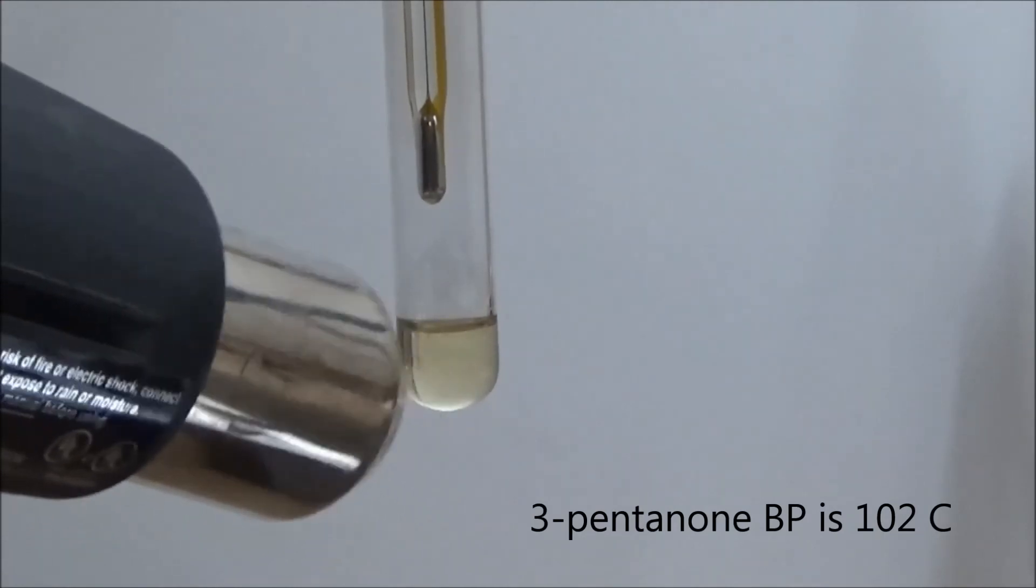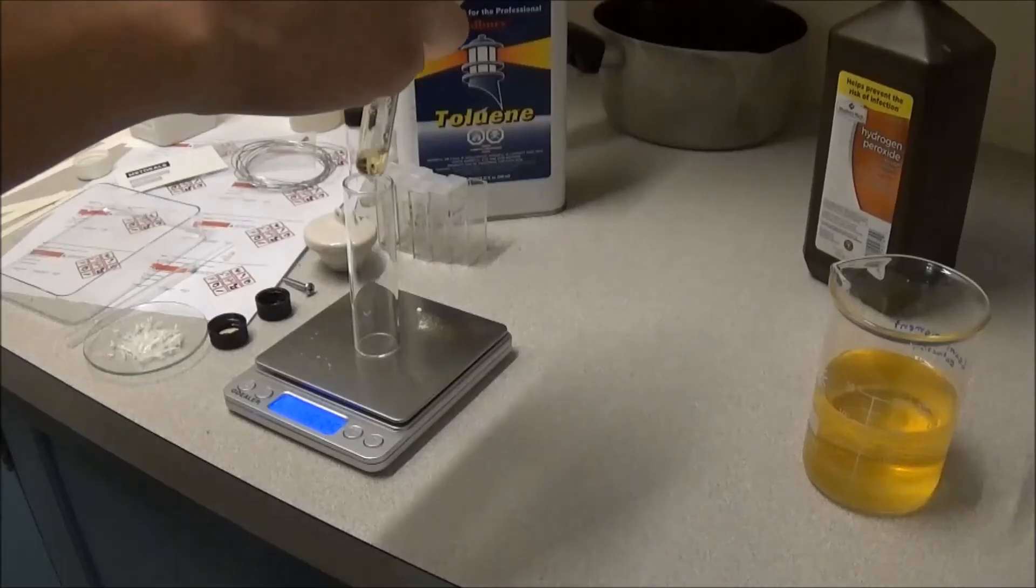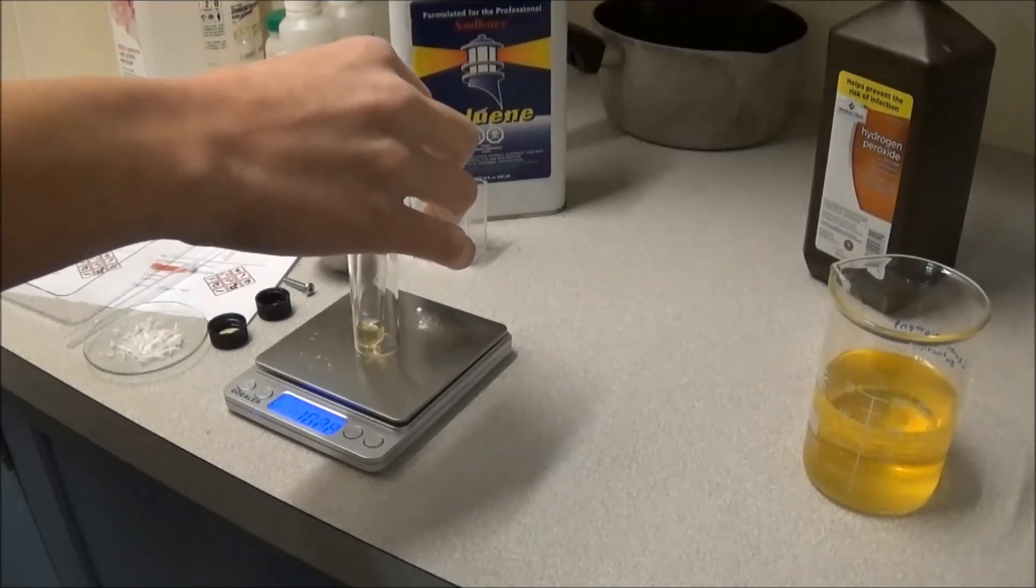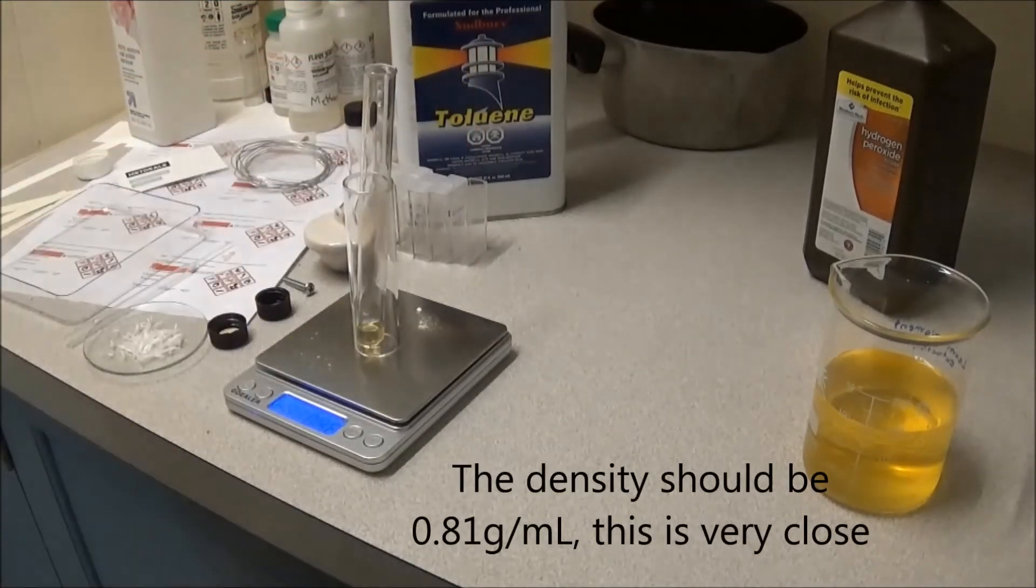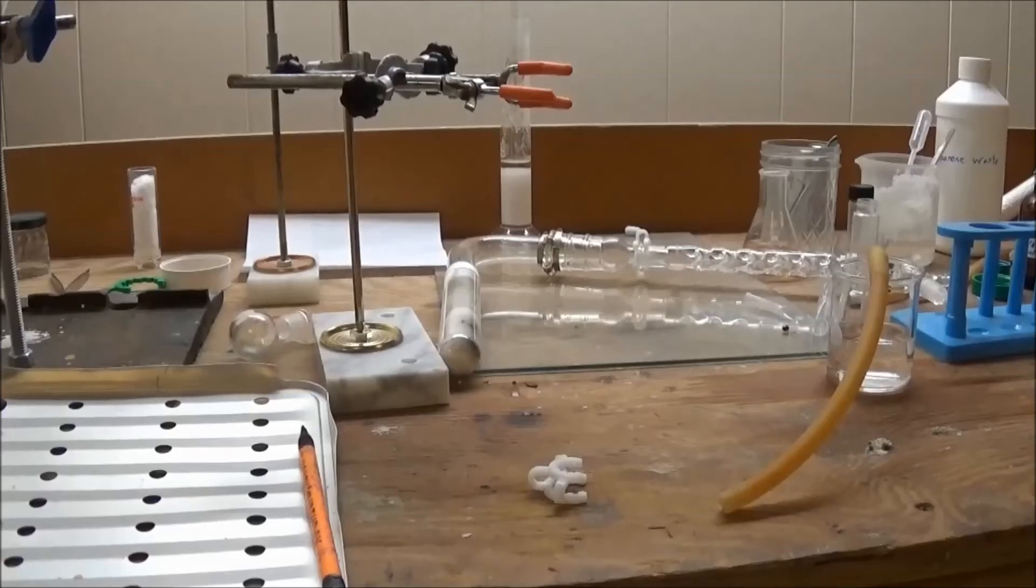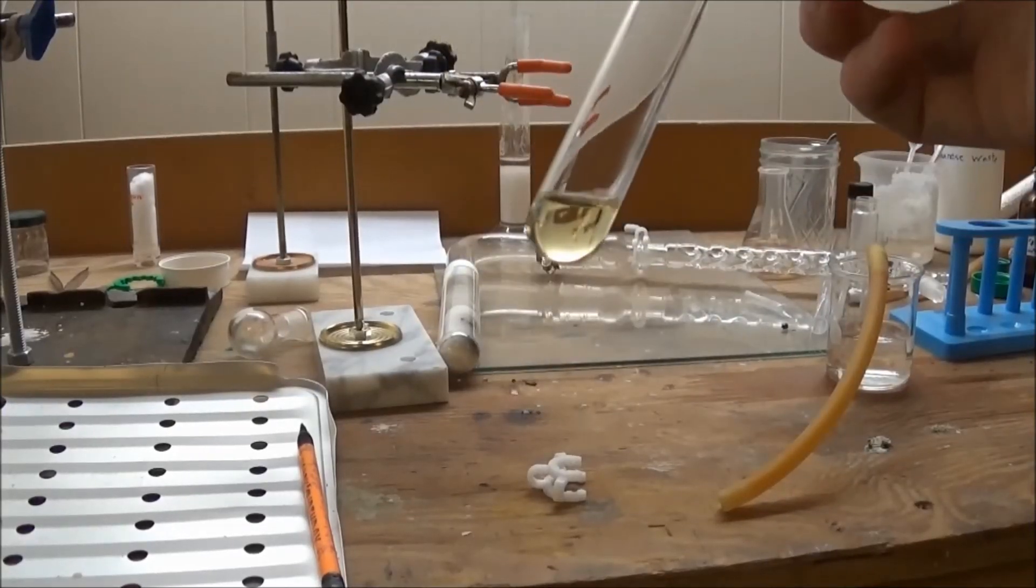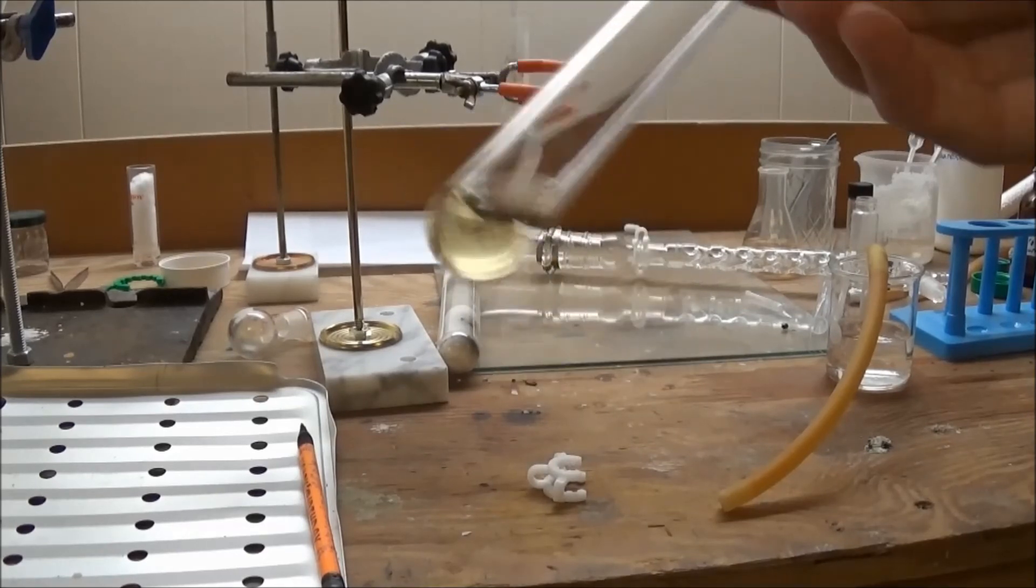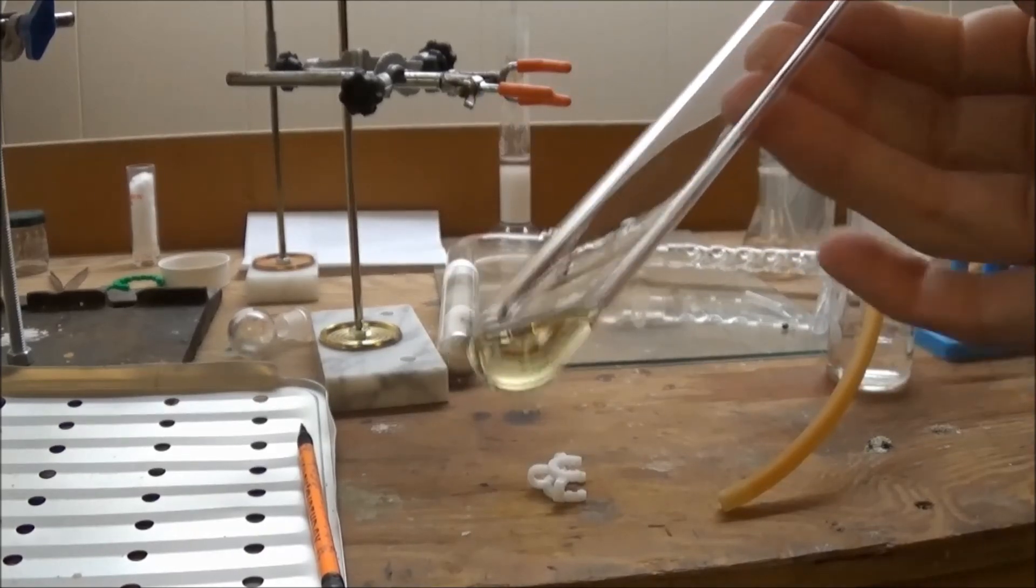Dividing the sample's mass by its volume, I found the density to be about 0.78 grams per milliliter. Given these various properties, the product here is mostly three-pentanone. The yield was quite poor at only 13 percent.